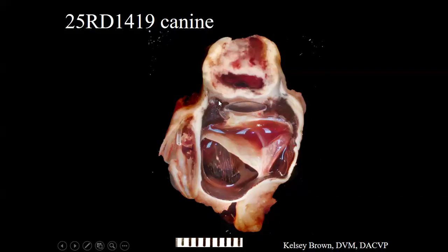Here is the anterior uvea. It's a little bit hard to make out the specific structures. The iris has been reduced to a nubbin, essentially, at this point, so extremely distorted. There's some kind of tan tissue along the posterior aspect of this intraocular lens. And then we have our retina right here, which is detached.